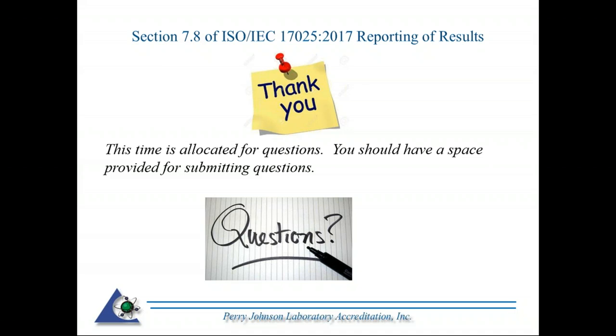Are fume hoods something that would be under facilities and equipment? I would say so. Fume hoods, particularly in your testing organization, that is something that should be considered equipment. And I know they are something that are subjected to tests.